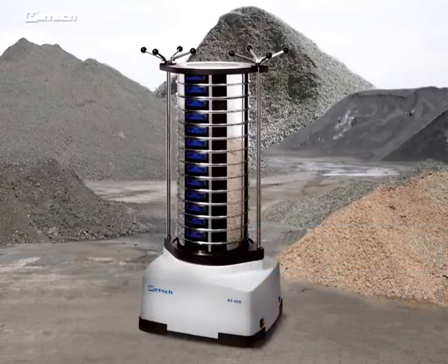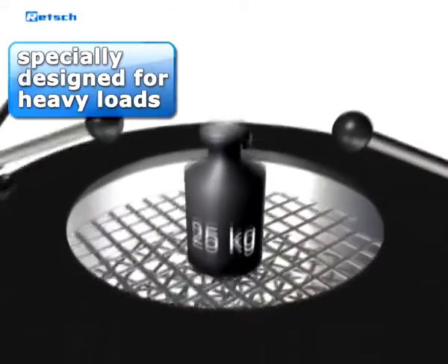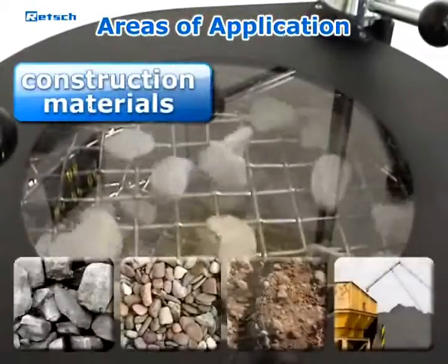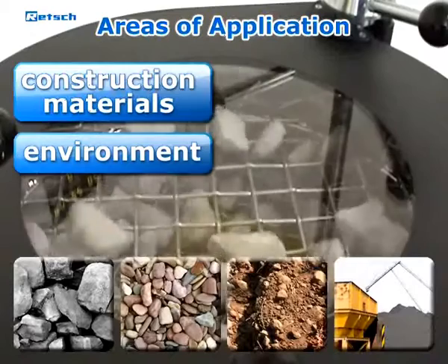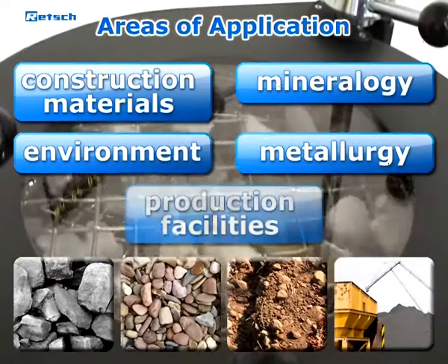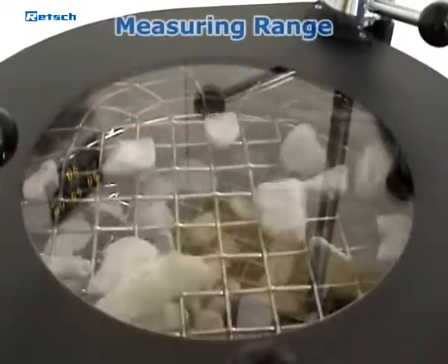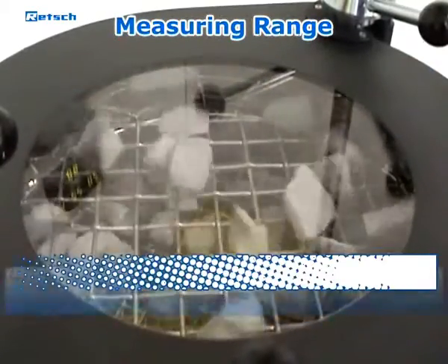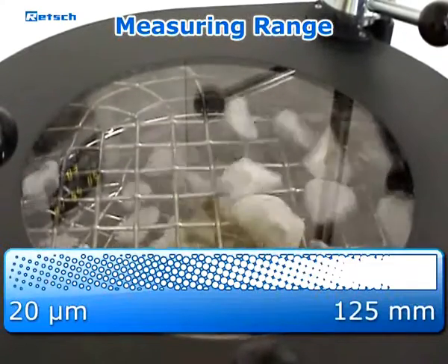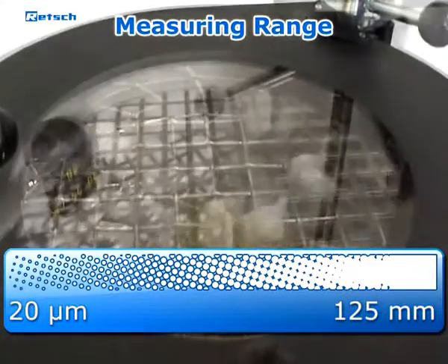The AS450 Control has been specially designed for sieving heavy loads of up to 25 kg per batch and is therefore particularly suitable for use in a range of fields. It can also be used for sieving batches in production facilities. These areas of application often demand a wide measuring range, which is ideally matched by the AS450 Control. Particles in a size range of 20 micrometers to 125 mm can be analyzed quickly and reliably.